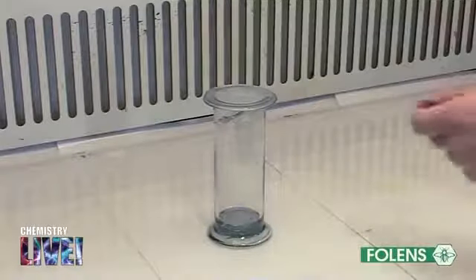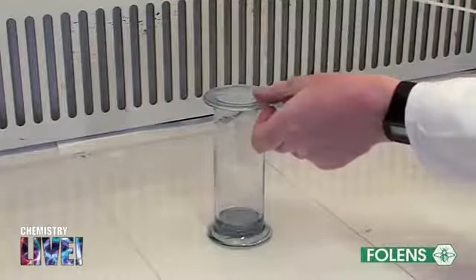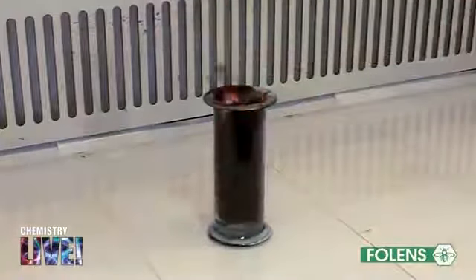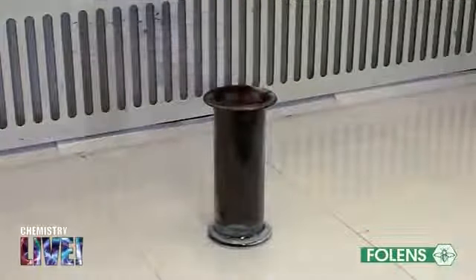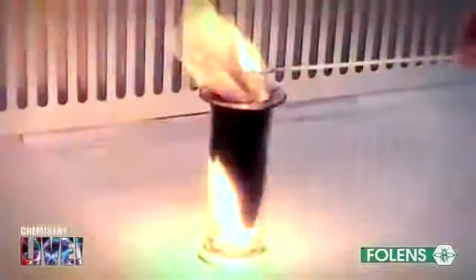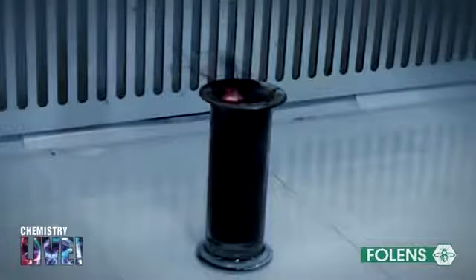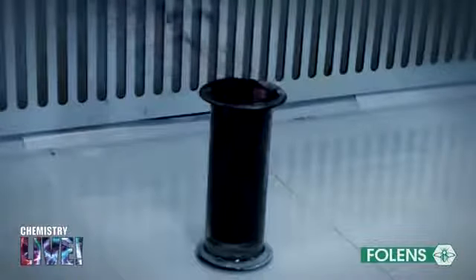Combustion. If your teacher allows it, bring the gas jar of ethine to the fume cupboard. Remove the gas jar cover and apply a lighted taper to the mouth of the gas jar. Note that it burns with a luminous smoky flame and a great deal of soot is formed. The soot is formed as a result of unburnt carbon.